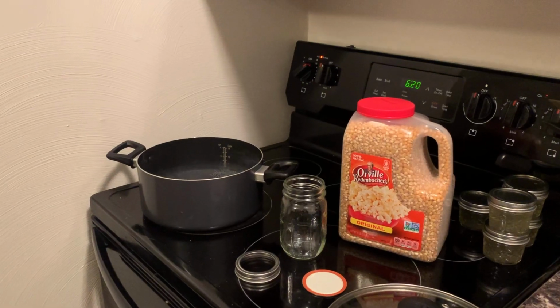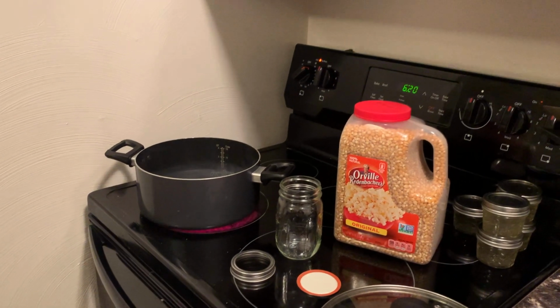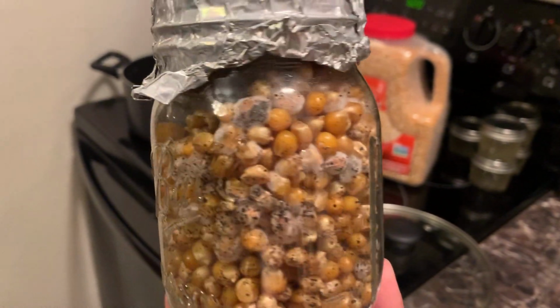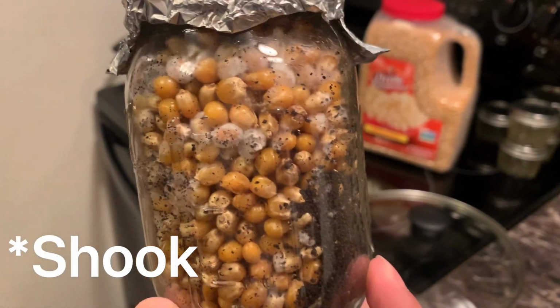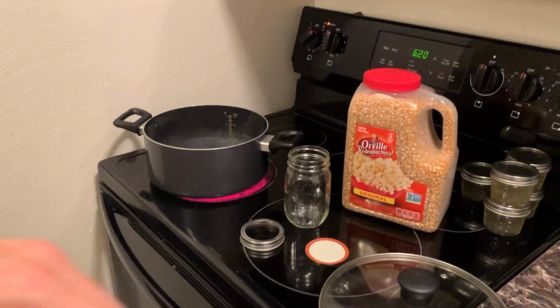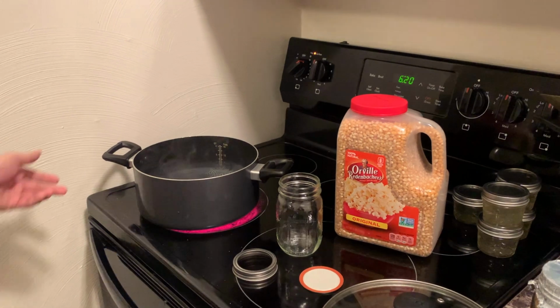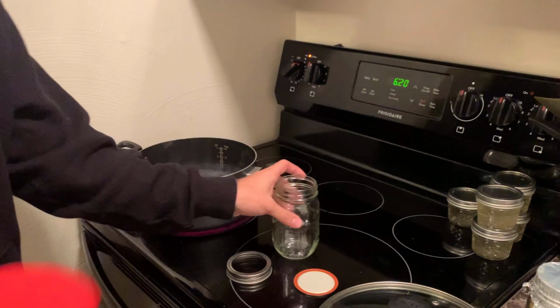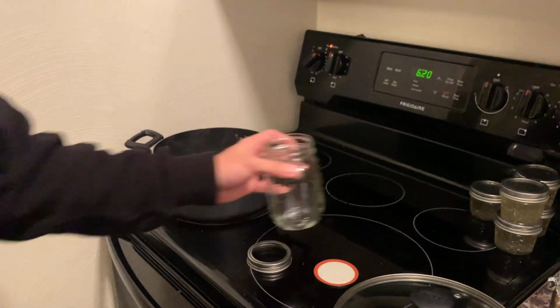What's going on, guys? Today I'm going to show you how to create your own mushroom spawn jars like this one here. This has recently been shaken so you can see the mycelium growing on the small kernels. So what you're going to need is a pot to boil your water and your popcorn, and then obviously your jars that you're going to grow in.